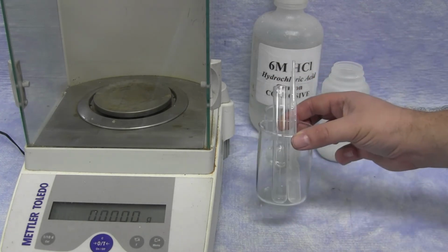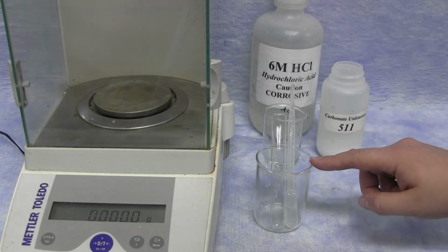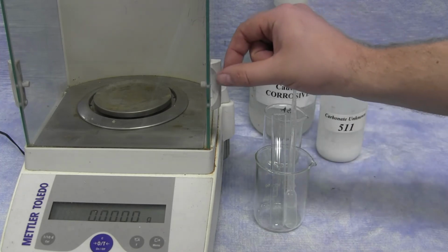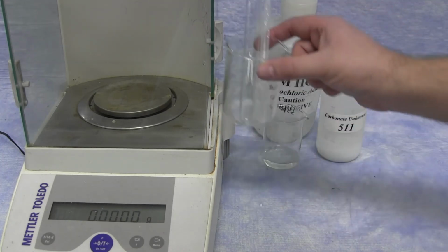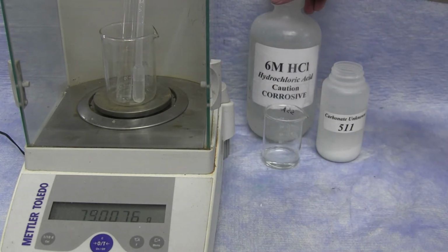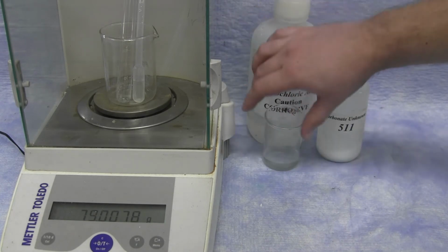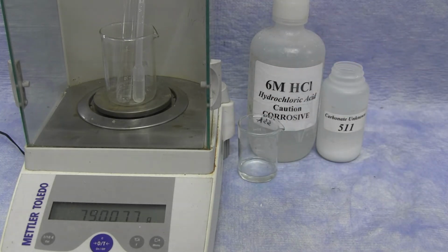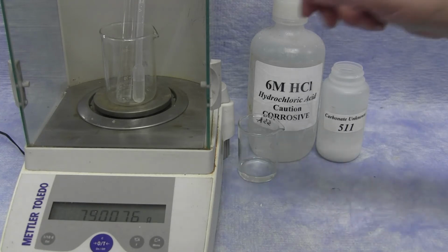You're going to obtain the mass of the total setup: beaker, empty test tube, and the pipette containing hydrochloric acid. You're going to be obtaining the mass on an analytical balance. The total mass can be read out to 4 significant figures, or 4 decimal places. In this case, we have an initial mass of 79.0076 grams. All of the digits are significant.